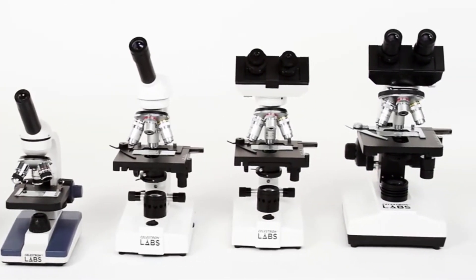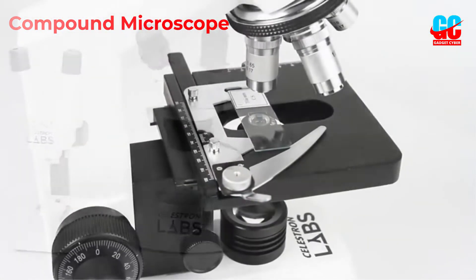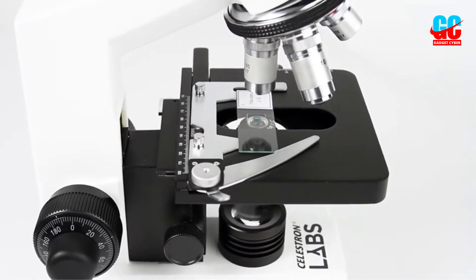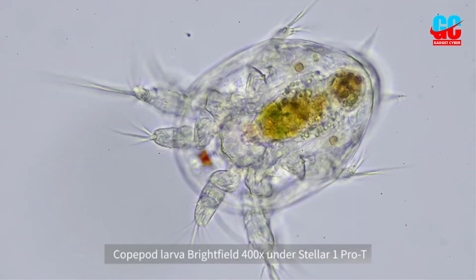Whether you're a student, collector, hobbyist, or professional, a compound microscope can be a very useful tool across many different fields. If you've recently decided to purchase a new compound microscope, you have come to the right place.